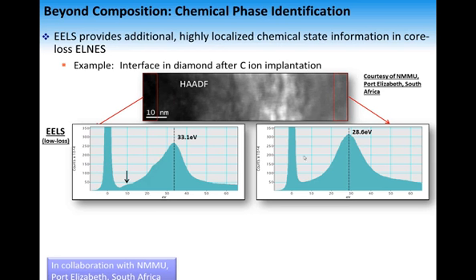You see the plasmon change shape. We lose the feature at 23 eV. And here we have the plasmon shifting to lower energy. So there is a difference between these two materials. It's a different chemical structure, and also the diamond is a highly insulating material, fully sp3 hybridized, whereas the amorphous carbon has a certain content of sp2, which we can actually measure.